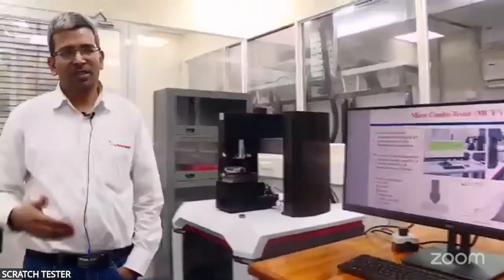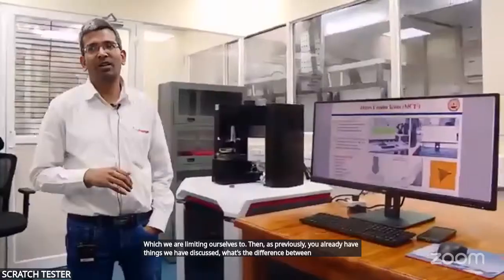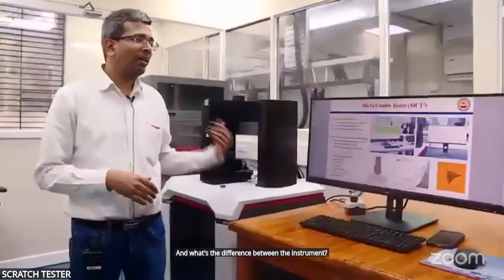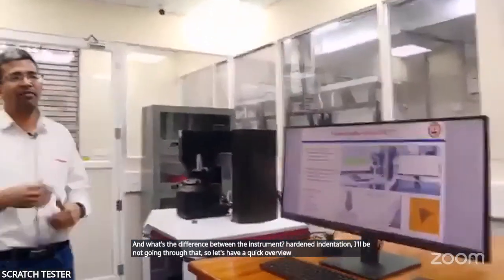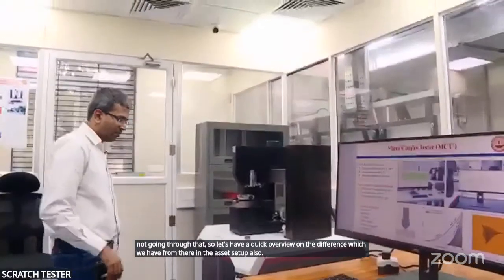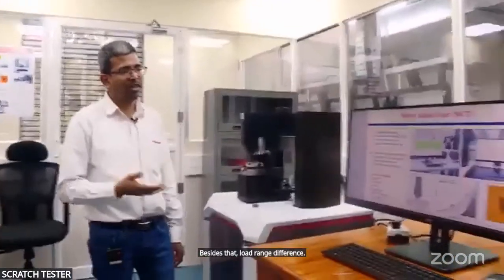Then, as previously discussed, what's the difference between conventional testing during the morning sessions and what's the difference between the instrument hard indentation. I won't be going through that. So let's have a quick overview on the difference in the setup also. Besides that, the load range difference for scratch and indentation.